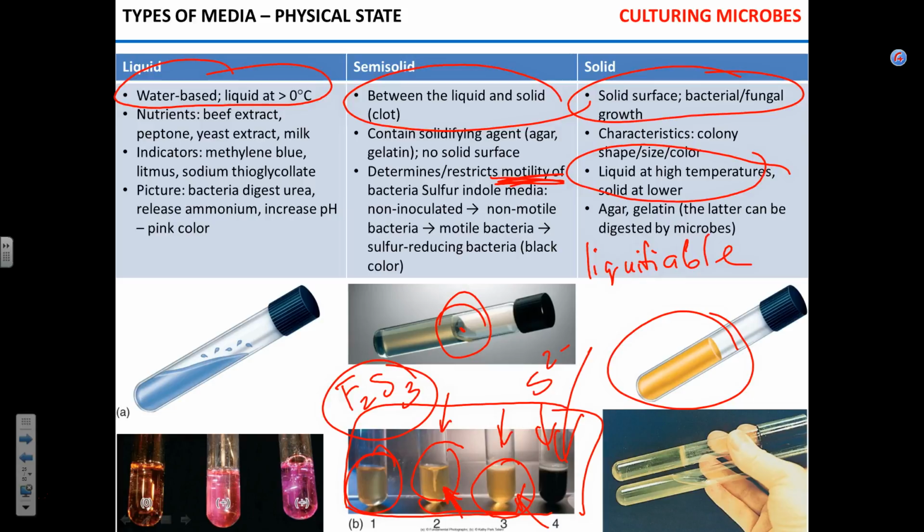We're going to add nutrients there. Nutrients can be precise chemicals. Which nutrients would a bacterial cell need based on your knowledge of biological processes? Glucose, so carbohydrates, usually glucose, yes. Sometimes you can add some other sugars. What else? Water. We can consider it as a nutrient. Depends. Lipids and carbs are sources of energy.